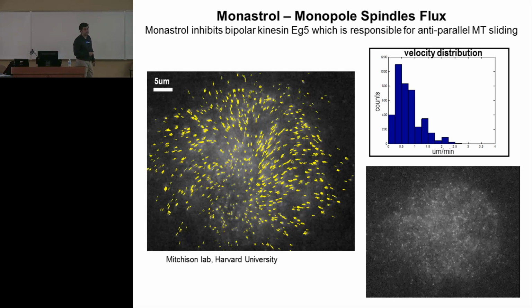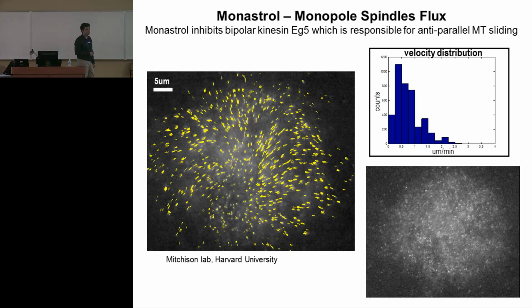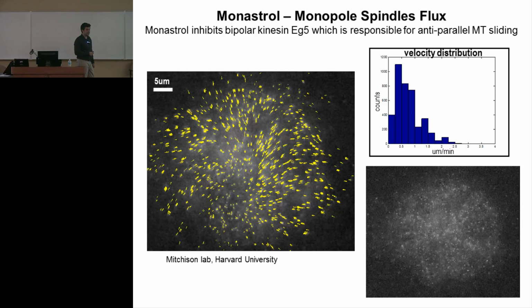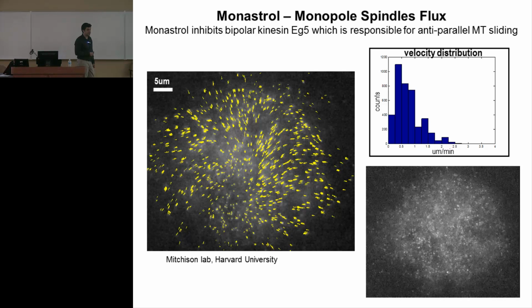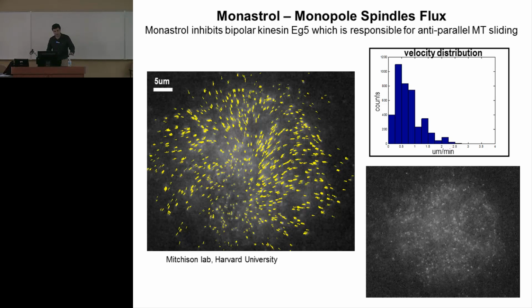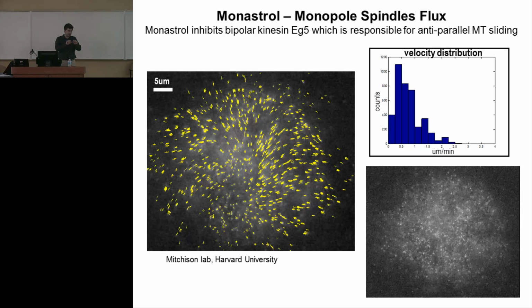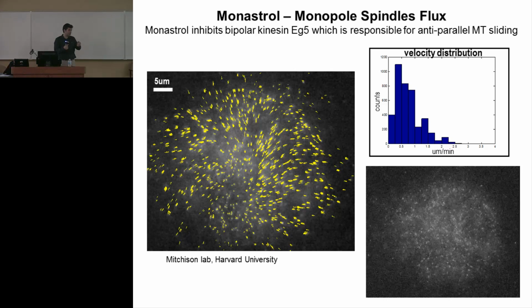First, do you know that the speckles you're tracking in successive frames are the same exact points in the actual object? Because the way you explained initially, it seemed like they were subsamples of the actual structure. Yes, it's not defining a unique fiber. Also, remember how they're formed: they get incorporated into the lattice, but they also fall off.